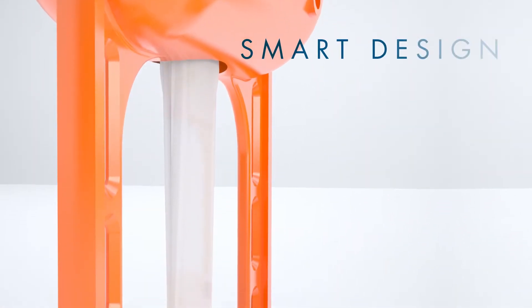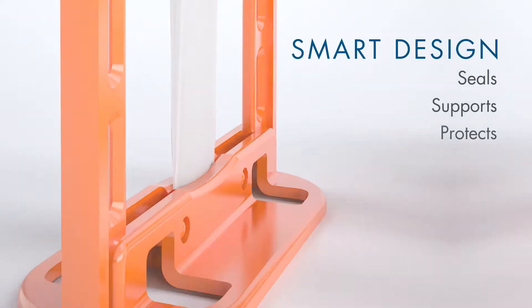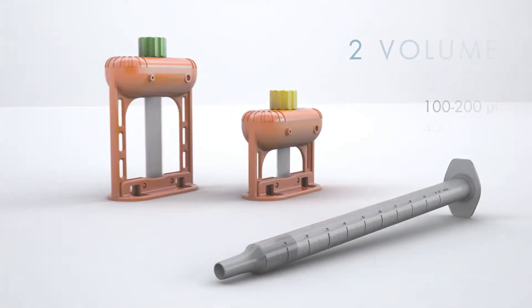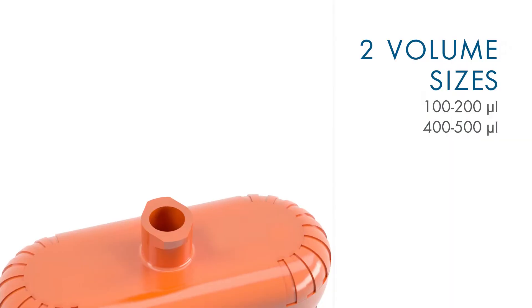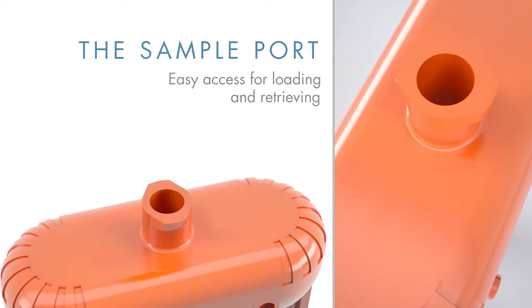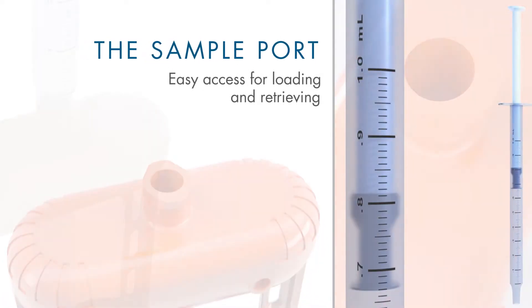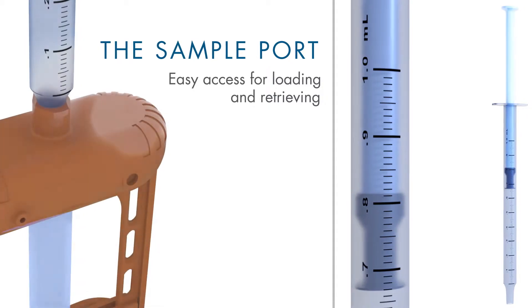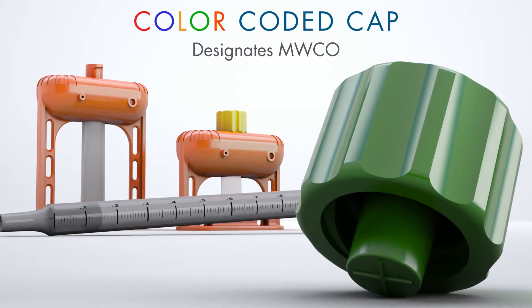consists of a rigid scaffold that seals, supports, and protects the membrane-defined sample chamber, which holds either 100 to 200 microliters or 400 to 500 microliters. The Luer lock sample port provides easy access for loading and retrieving the sample using the included 1 milliliter syringe. The resealable, leak-proof cap is color-coded for the membrane molecular weight cutoff.